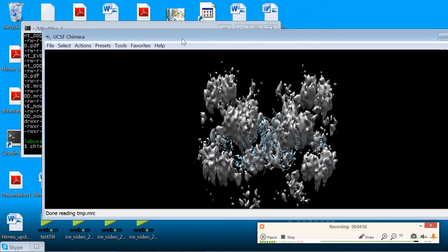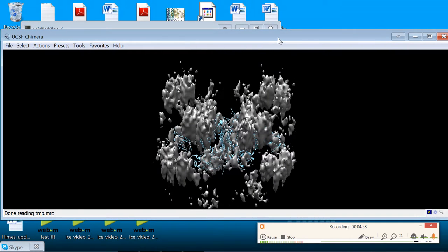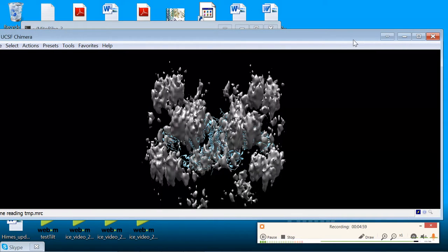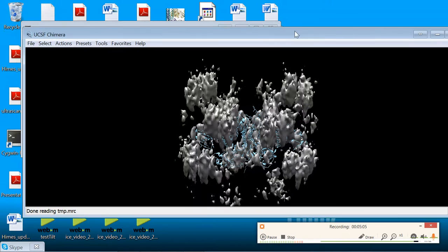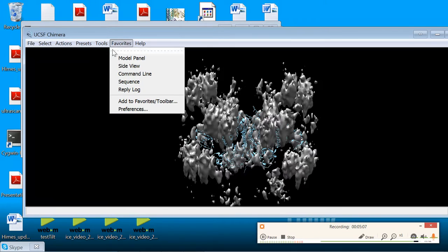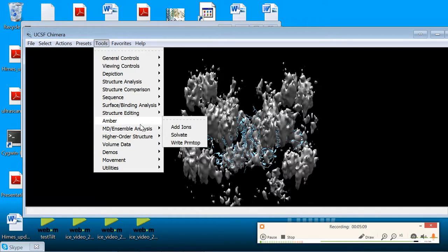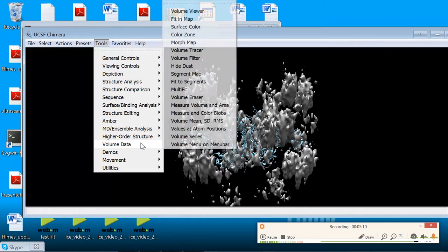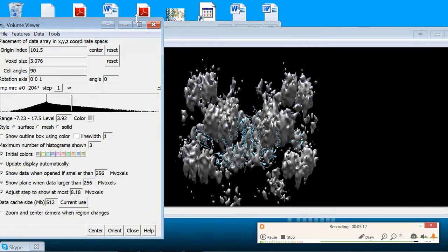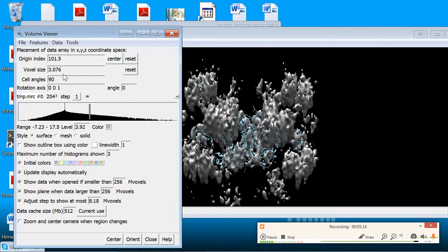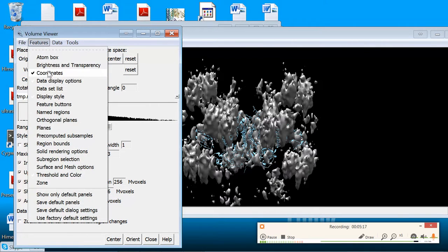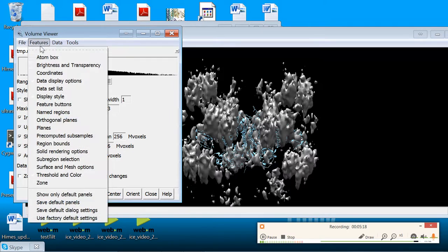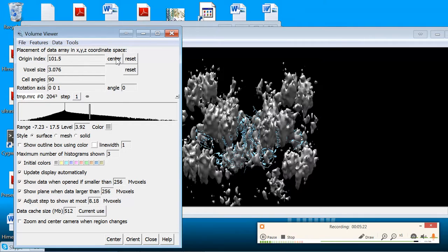So to recap that real quickly, in order to rapidly fit a PDB into a map, you can just open them both in Chimera. Once you have them open, you go to Tools and Volume Data in order to operate on your map. If you need to adjust the pixel size or center the map, go to Features and open the Coordinates menu, which I by default have turned on. And you can change the voxel size and hit Enter. And then center the map by selecting the Center key.